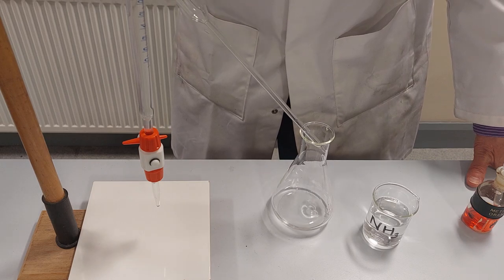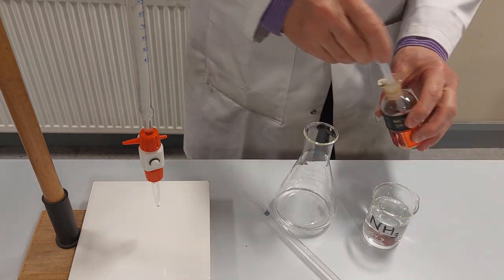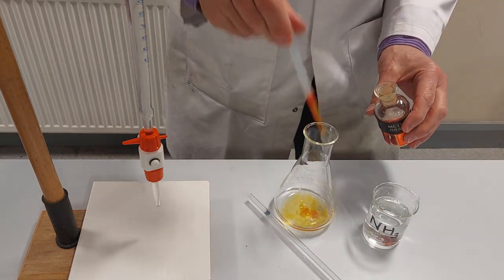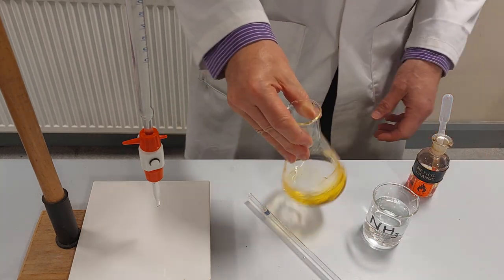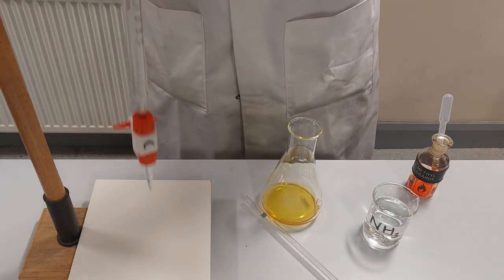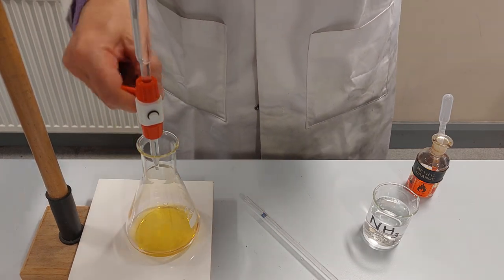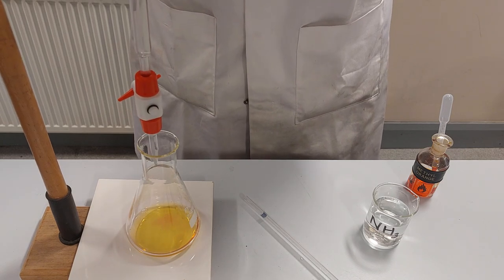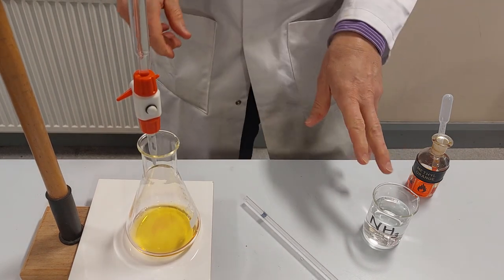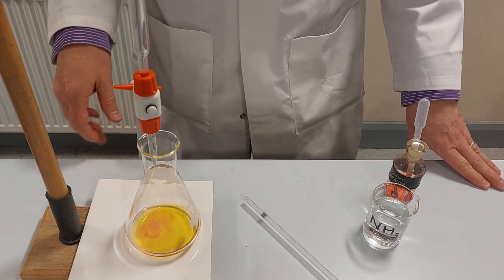So we run that all the way into the flask there and I'm going to add a little bit of indicator. The indicator I'm using today is methyl orange. That goes a nice orange color in a base and in an acid as you might have seen there it goes kind of pinky color.